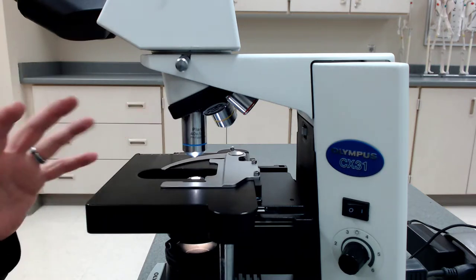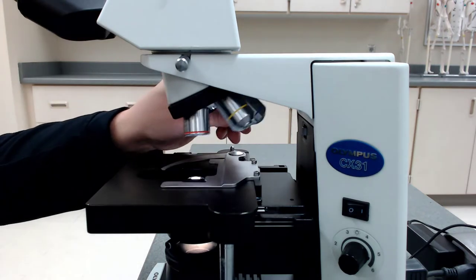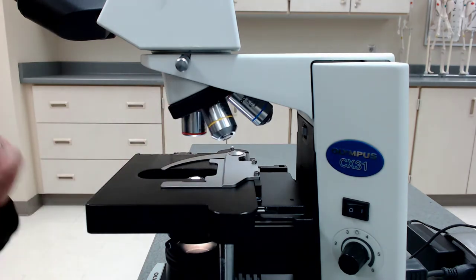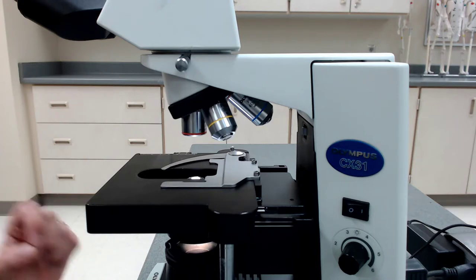So those are your objectives. This is a parfocal microscope because these objectives are all linked together. So what that basically means is the better job you do early of focusing your specimen, the easier it is later on.